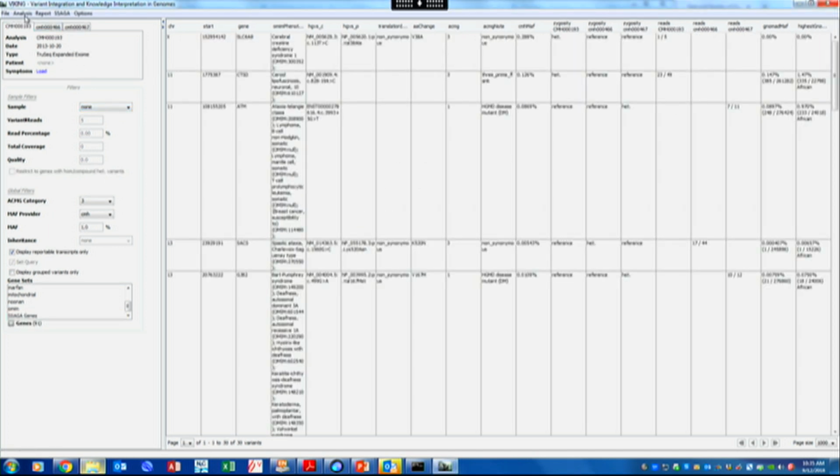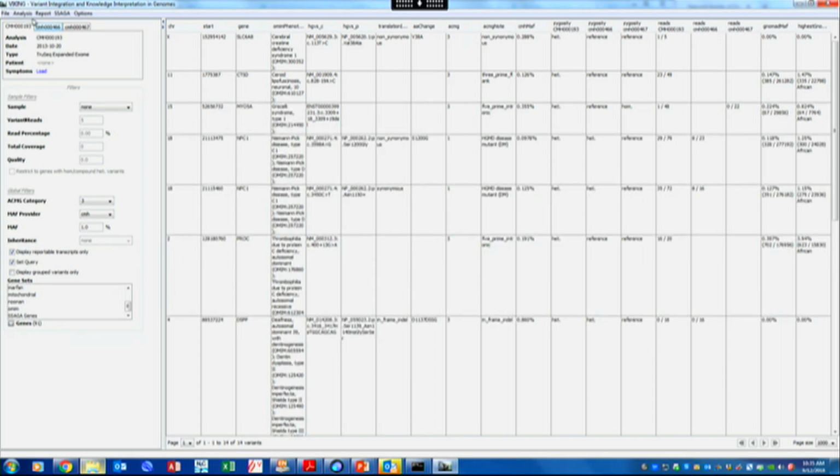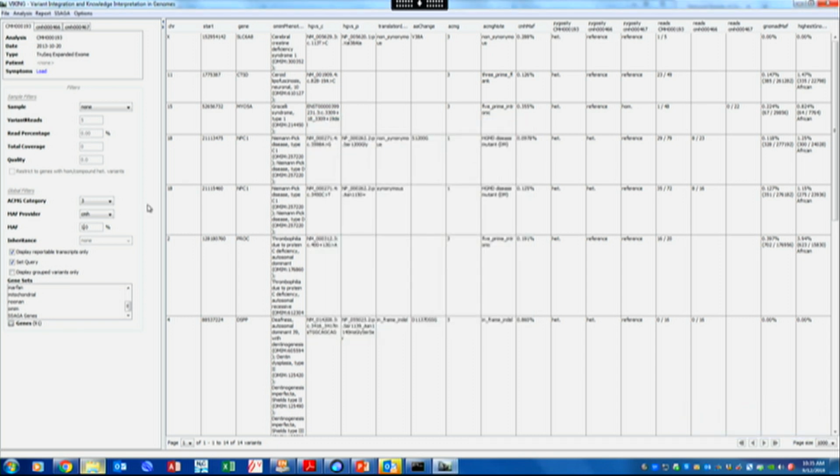Okay, so I'm going to go under analysis, and I'm going to set my query to say I want it in the child, only the child. And I'm going to set the parents up. This one is the mother. Oh, wait. Sorry. That's the child. This one's the mother. And this one's the father. Okay, so mom and dad are in there.